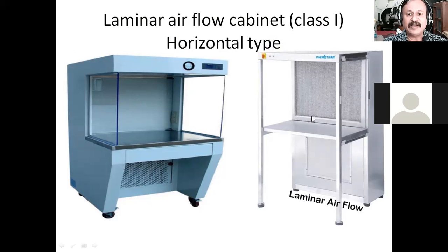If you look at this gray portion here, which I'm showing with the cursor, this square or rectangle, that is where the HEPA filter is placed. And therefore the air is flowing from the back of the cabinet to the front. The air is coming toward the face of the operator, and as I told you, the lid should be brought down to cover the face of the operator, so that even if there are no pathogens, why should we take the risk, isn't it? So the air should not directly blow on the person's face. Is that okay?